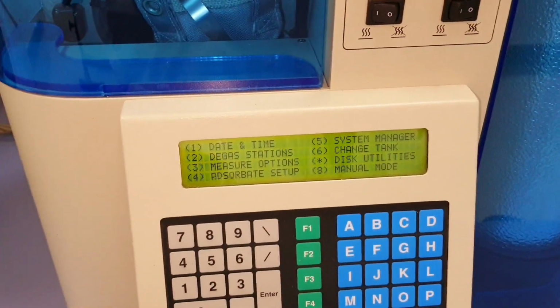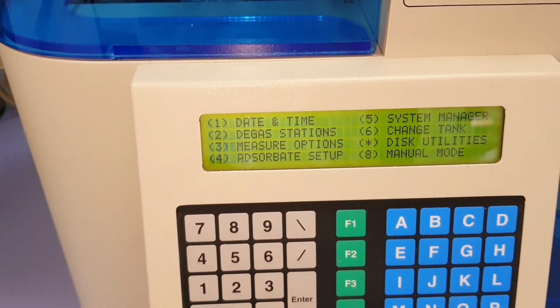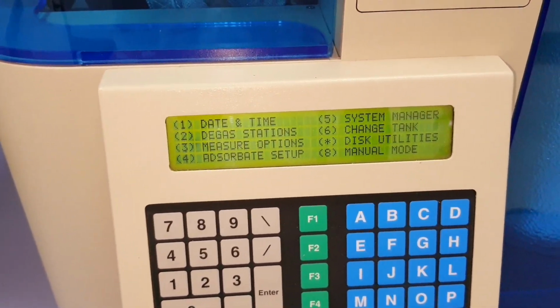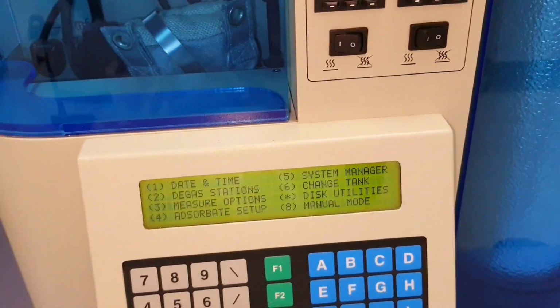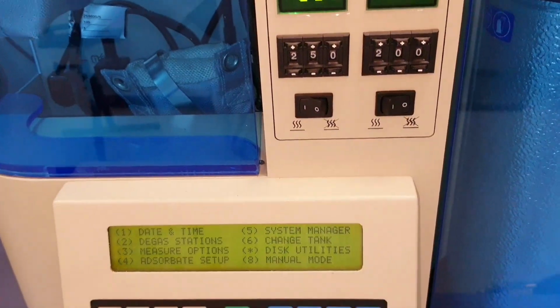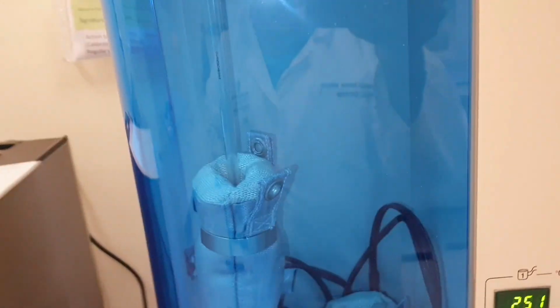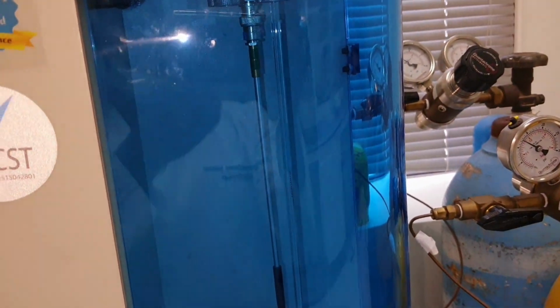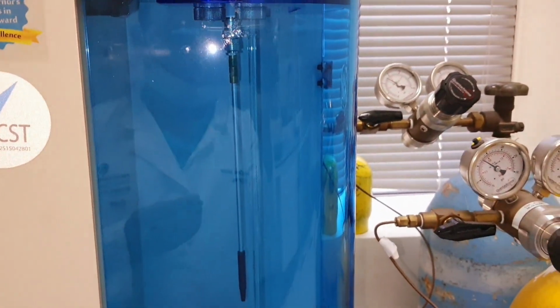Now this is the screen of our device. You can see there are certain options. We need to play with these options. Now we will try to enter the information using the buttons, or you can say the controls down here.